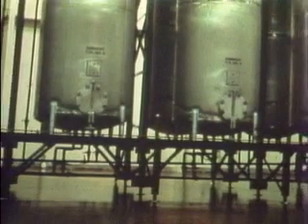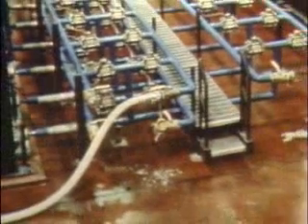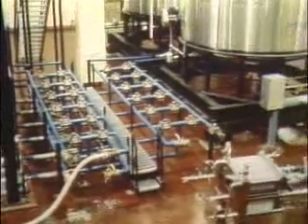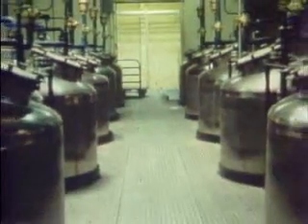Today, commercial distilleries operate under modern sanitary conditions. Distillation equipment and techniques have been modernized, but the basic process of distillation remains the same. In order to understand this process, it is useful to first consider the theoretical basis for distillation.